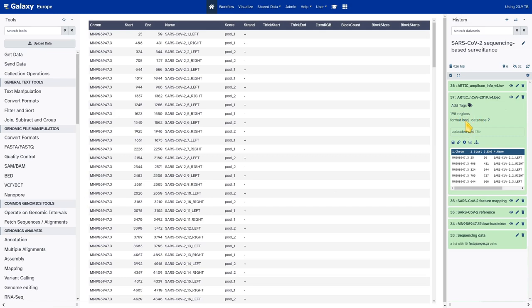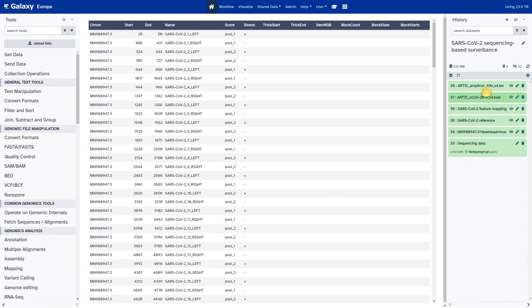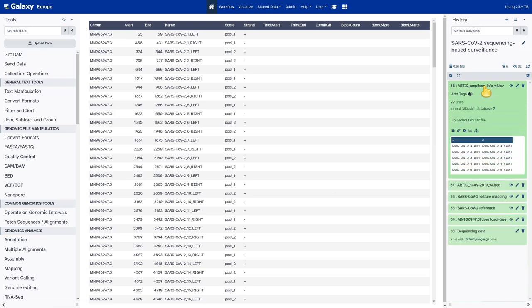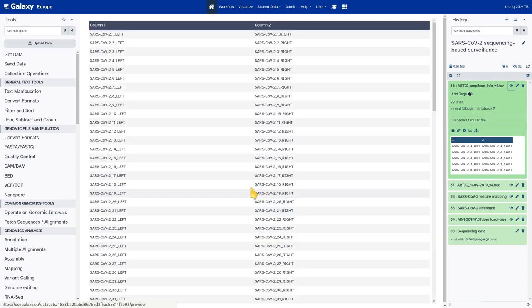The dataset type of this dataset is BED format, so that's fine. Then we have a second file describing the primer scheme — not to be confused with the first one. This dataset is the Amplicon Info file and its data type should be set to tabular. Looking inside, it's a tabular dataset with one line per amplicon produced by the primer scheme, listing the primers responsible for the formation of a given amplicon. So we have primer number one left and primer number one right on one line, because together they form the first amplicon in that ARTIC V4 primer scheme.